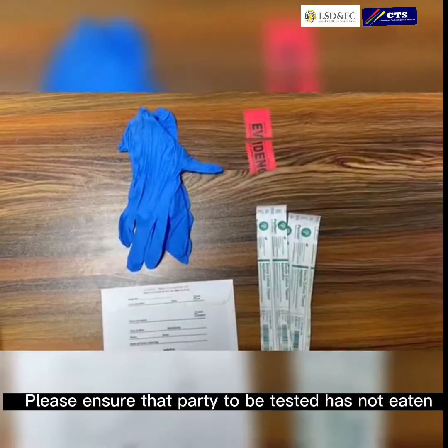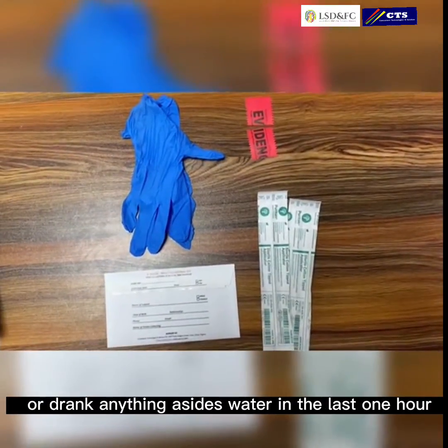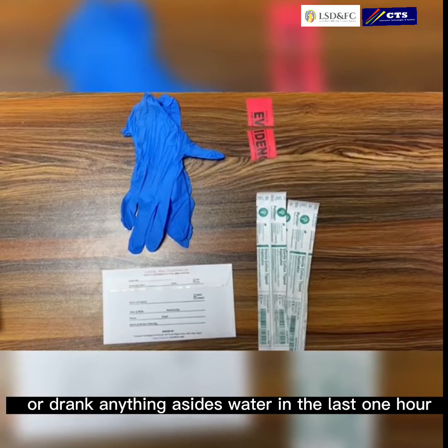Please ensure that the party to be tested has not eaten or drank anything in the last one hour.